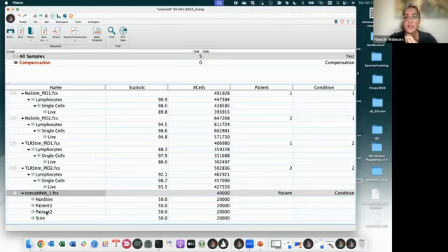You will need to use a single FCS file, and keywords will be the thing that will help you to combine all these things together and to assign each individual characterization to that. So if I use keywords, then I can know which one is patient 1, which one is patient 2, which one is condition 1, and which one is condition 2.